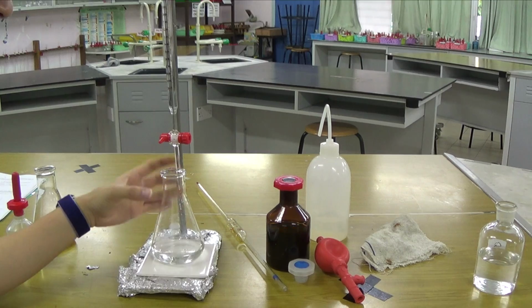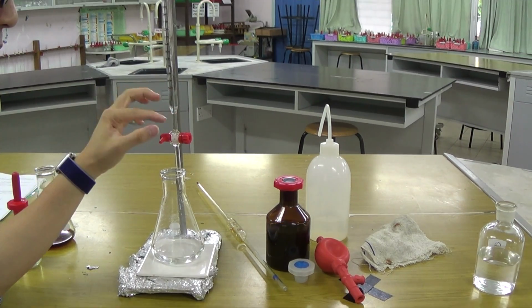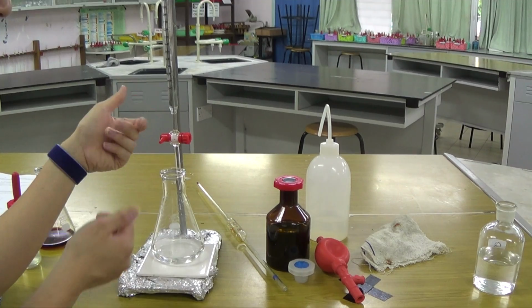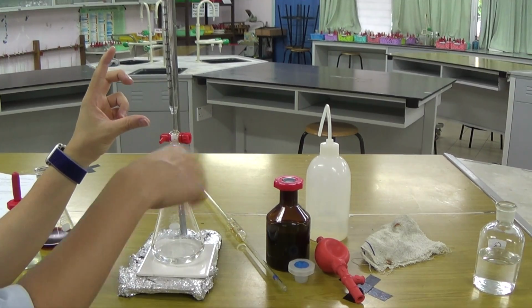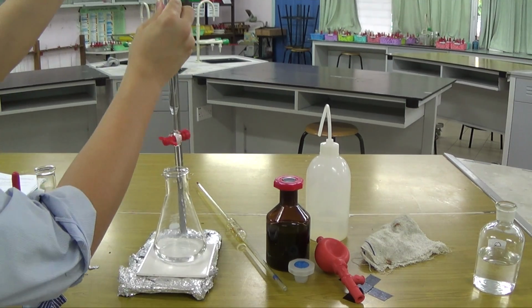Okay, this by far is not an accurate titration because I did not do it drop by drop. If you want accurate, you have to do it drop by drop. I was kind of going all the way, and then as soon as it changed, then I stopped. This is called a rough titration. I'm ready to read my reading now.